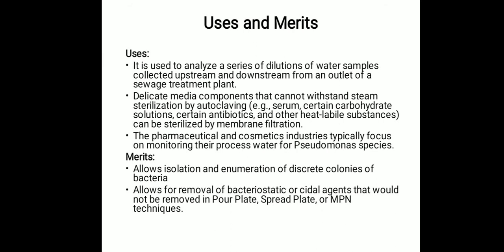So what are the uses and merits of the membrane filter technique? It is used mostly to analyze a series of dilutions of water samples collected upstream and downstream from an outlet of a sewage treatment plant. Another use is that a total count of coliform bacteria will determine the potability of the water source.